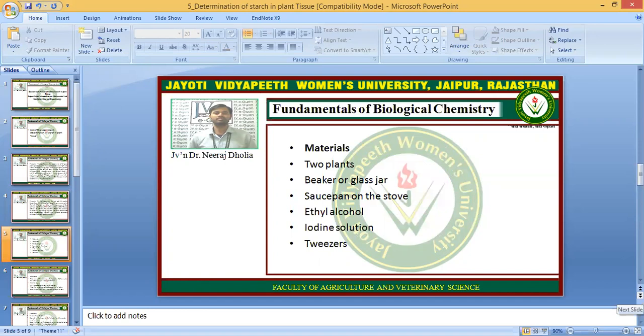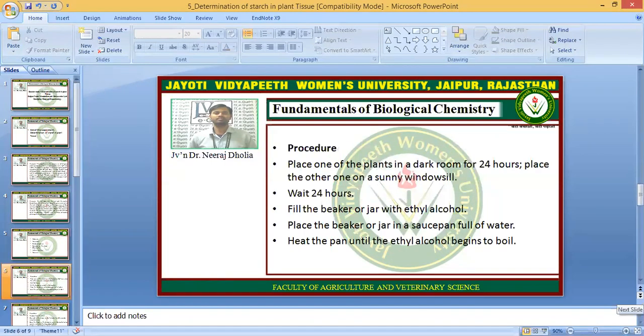So we need two plants, beakers, a glass jar, a saucepan on the stove, ethyl alcohol, iodine solution, and tweezers.